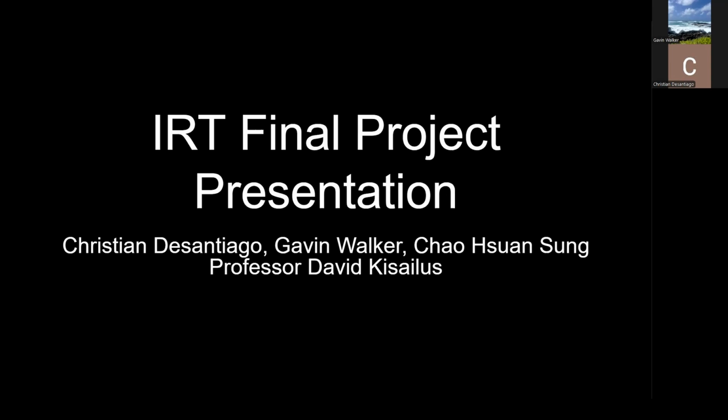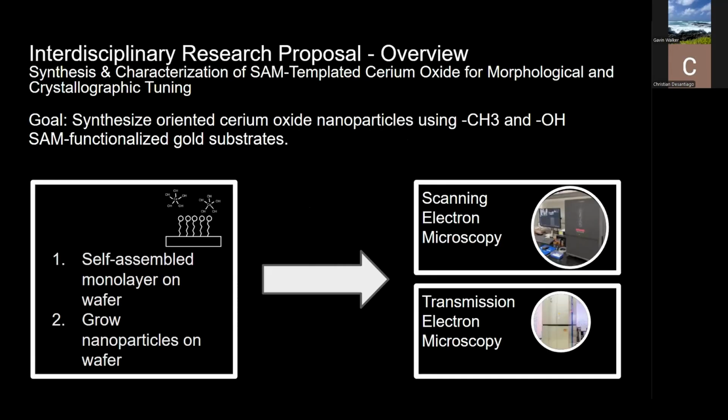This is our IRT Final Project Presentation. Our project is synthesis and characterization of SAM-templated cerium oxide for morphological and crystallographic tuning. The goal of our project is to synthesize oriented cerium oxide nanoparticles using CH3 and OH SAM functionalized gold substrates.